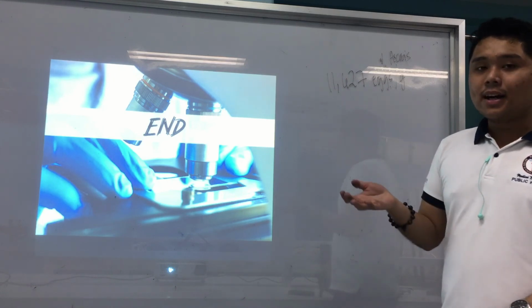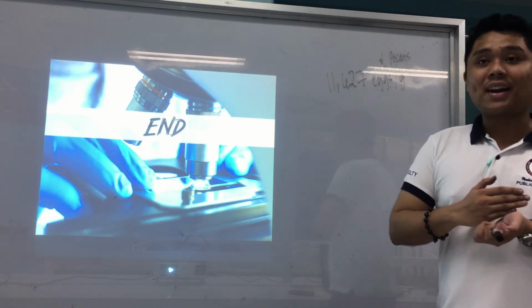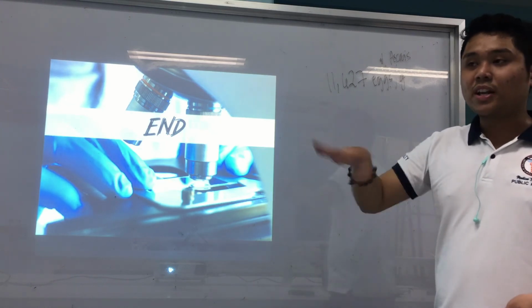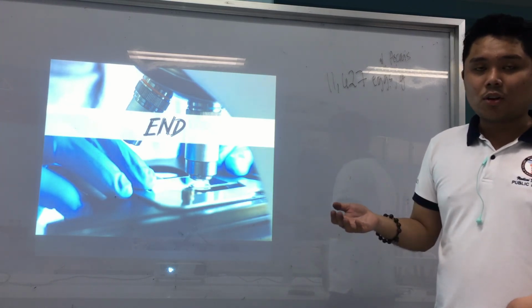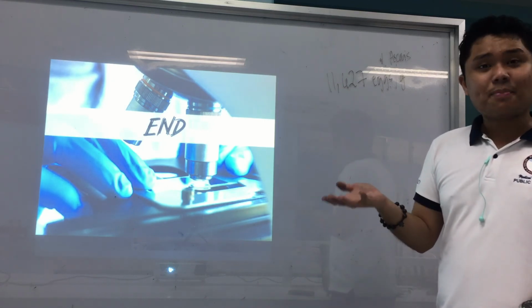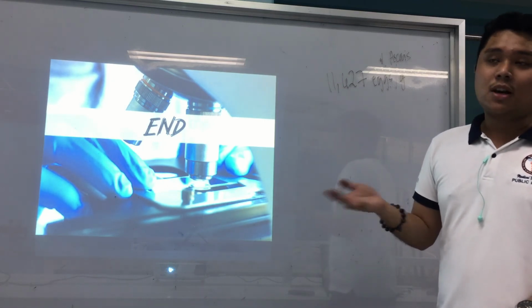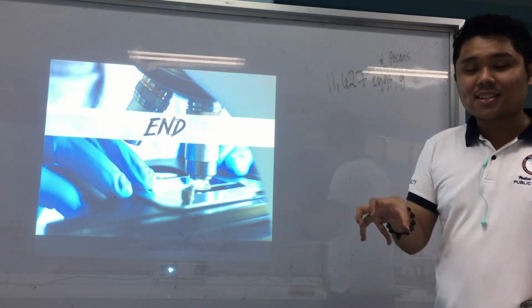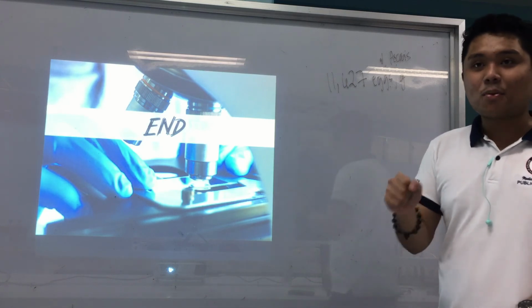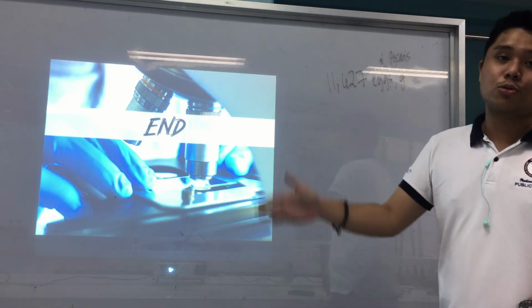Again, the next lecture, guys, we're going to discuss the different parasites that we can see from fecal smears, especially from your direct wet mount. Because you'll have that in the internship and when you become medtechs in the future. So we go now to the different eggs that we can see, focusing more on the helminths, the worms, from nematodes to cestodes.